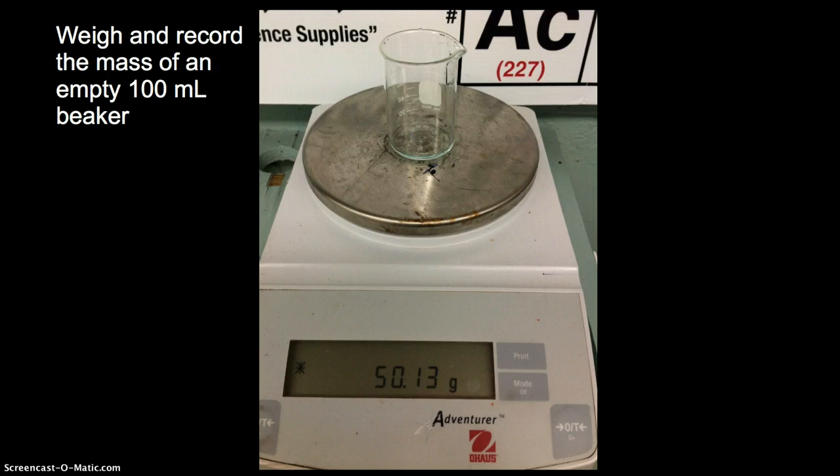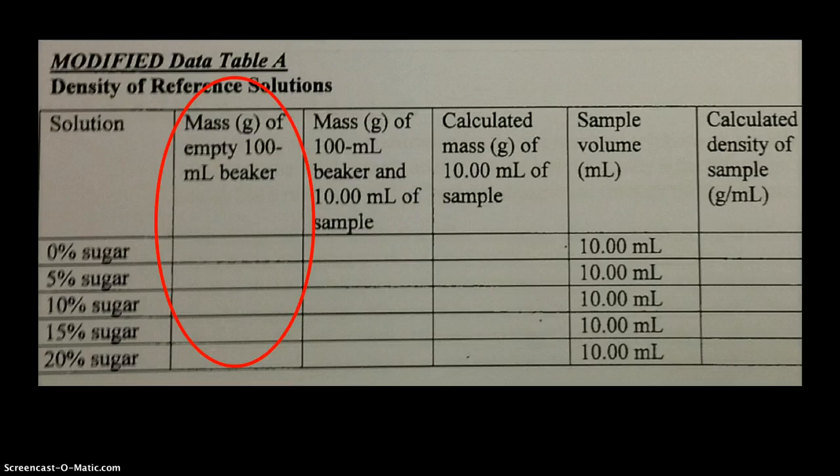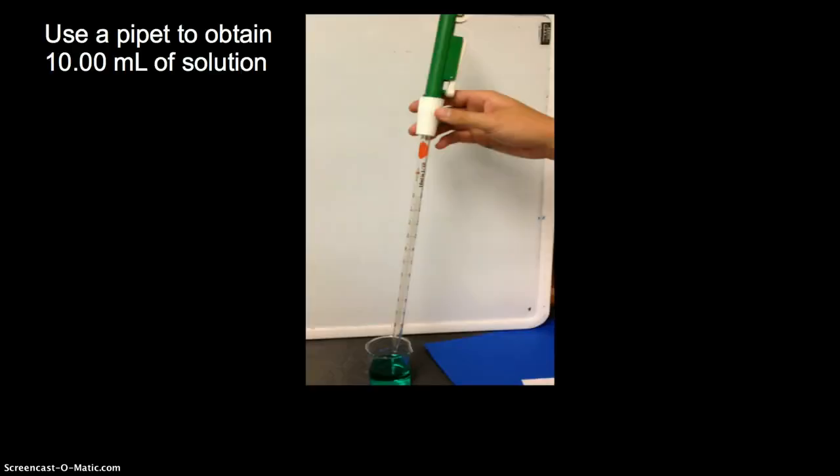Next, weigh and record the mass of an empty 100 milliliter beaker. Record this information in your data table in the first column, as indicated in this figure. Then you will use a pipette to obtain 10.00 milliliters of solution.